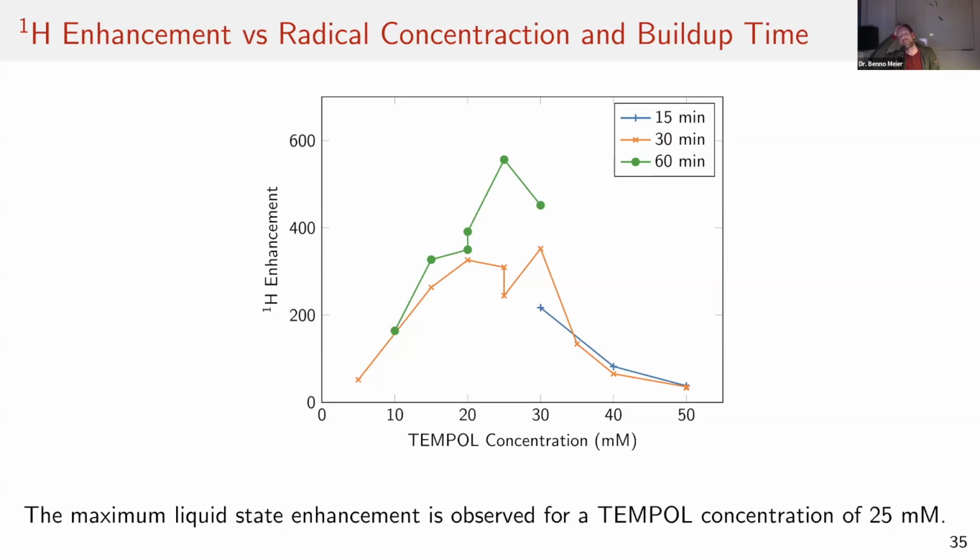Okay, so you explained the decrease in enhancement because of the paramagnetic relaxation occurring during the transfer? Yeah, that's an interesting question. Yes, we believe it's during the transfer because we also see this dependence on magnetic field during the transfer. We see that we are clearly losing there because we don't have enough magnetic field. But what exactly the mechanism is, how fast it is, these are things that we don't fully know.